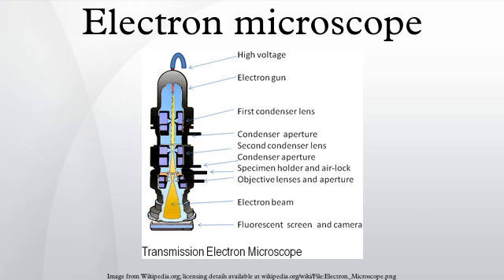Sectioning produces thin slices of specimen, semi-transparent to electrons. These can be cut on an ultramicrotome with a diamond knife to produce ultra-thin slices about 60 to 90 nm thick. Disposable glass knives are also used because they can be made in the lab and are much cheaper.